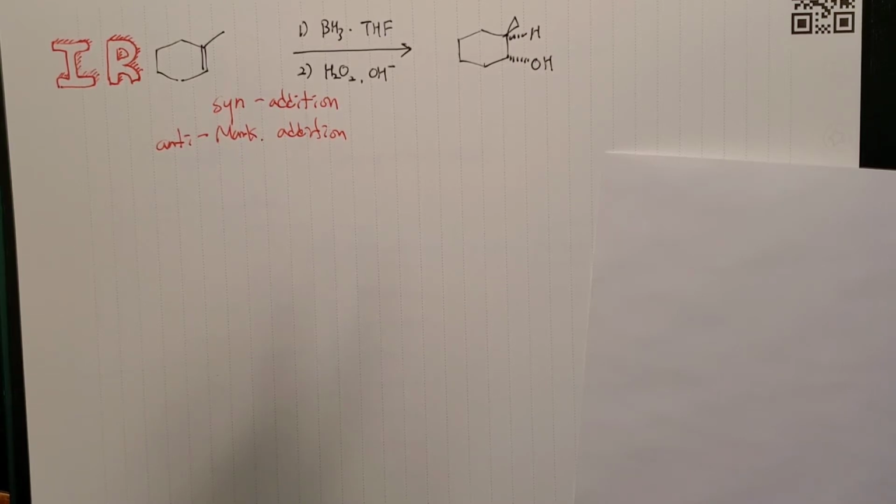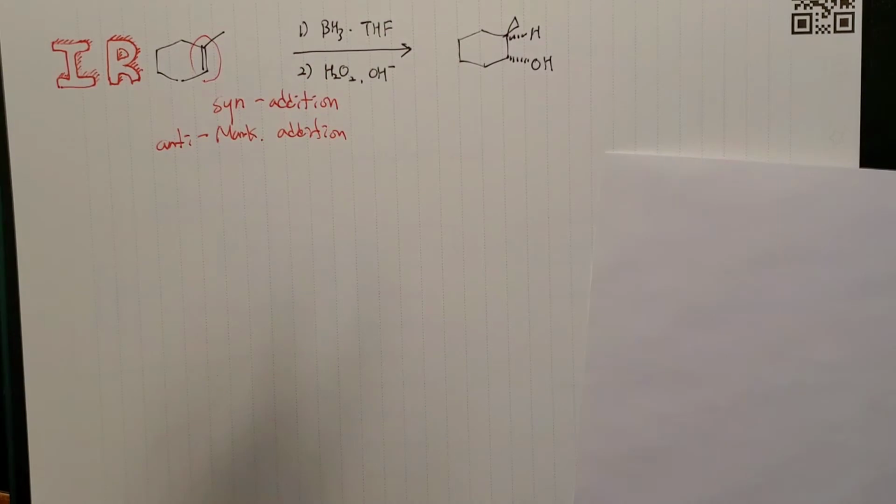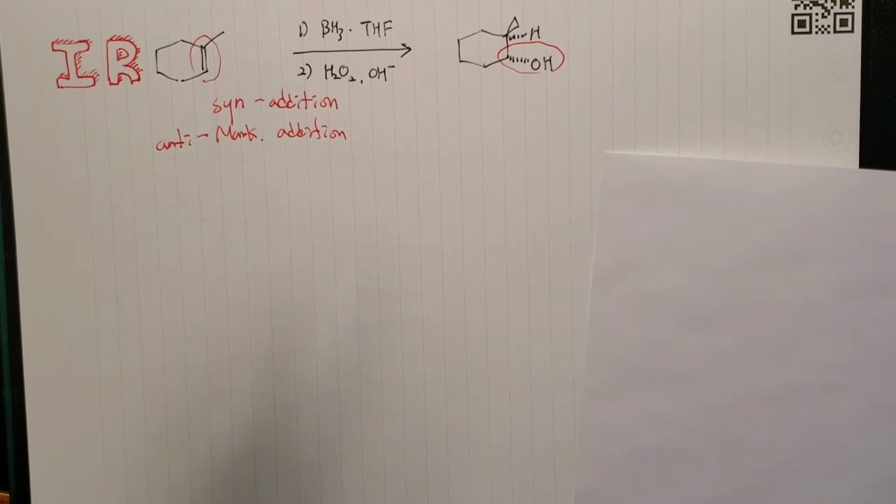And as we practiced all the time, the reactions take place around the functional group. So your functional group in the reactant, the double bond, is disappearing, and you get the alcohol instead. So those are the functional groups you are focusing on if you are using IR, or if you just want to confirm the product you get during the reaction is alcohol, and if that's enough for you, the IR is the instrument that you are choosing.